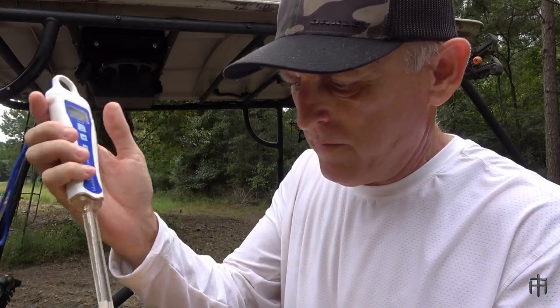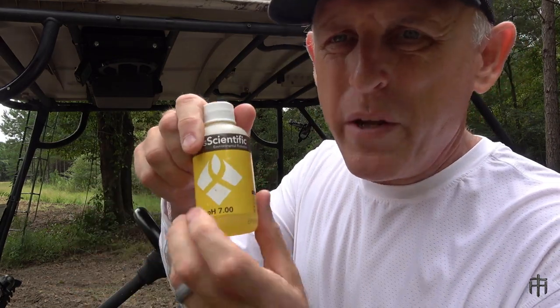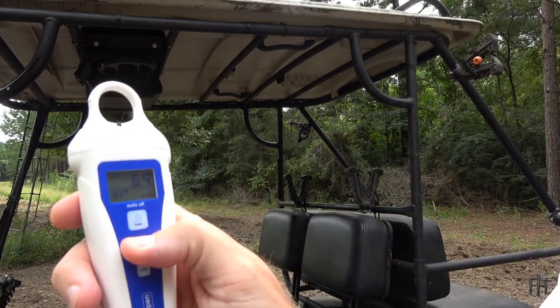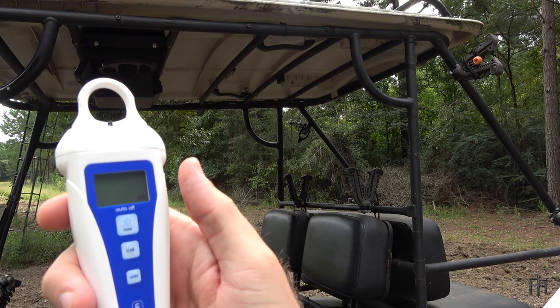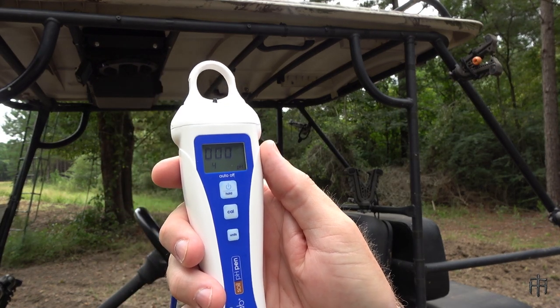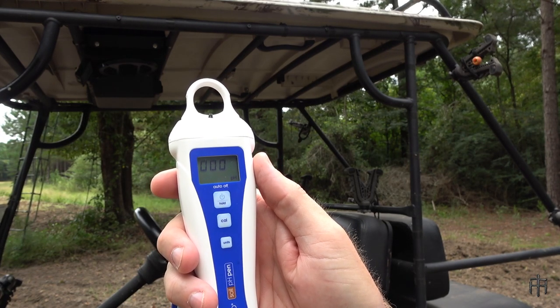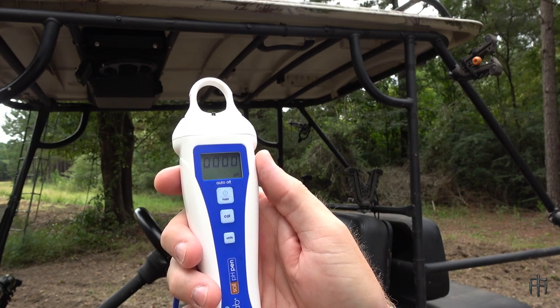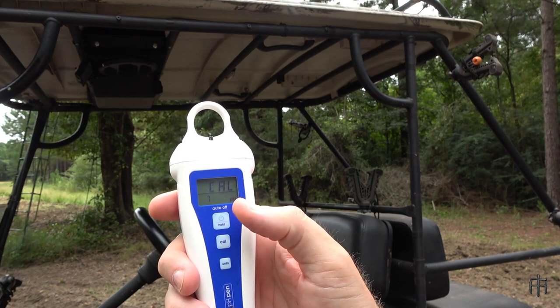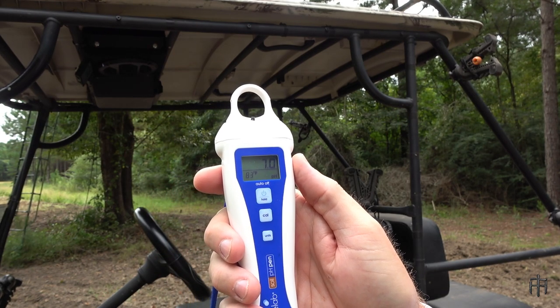Now I wipe it off gently and do the same thing with the pH 7 solution. Just a little bit is all you need. Dip it in, hit calibrate. You'll see one zero, then two zeros — there's a four blinking in the bottom left corner because that's what it last calibrated to, but it's about to change to a seven. Four zeros, and it's done — no error. Calibrated at seven, bottom left corner says seven. That's it, we're all calibrated and ready for testing.